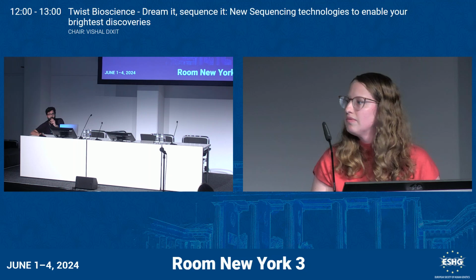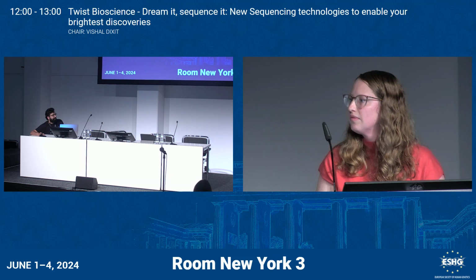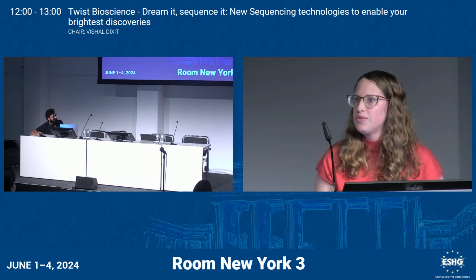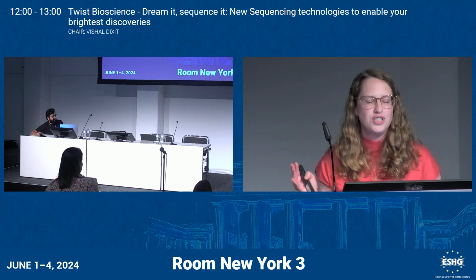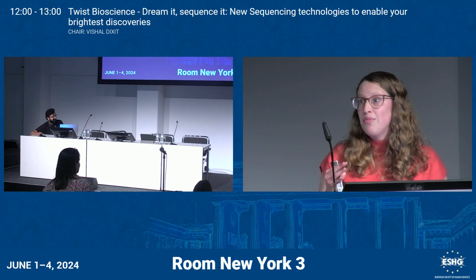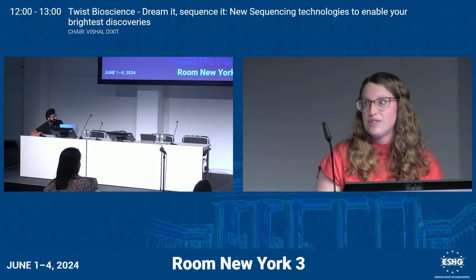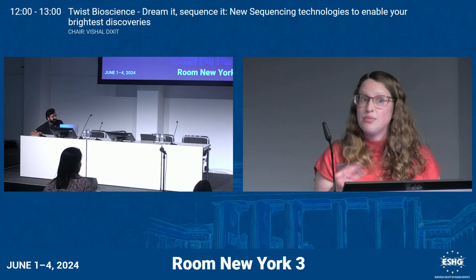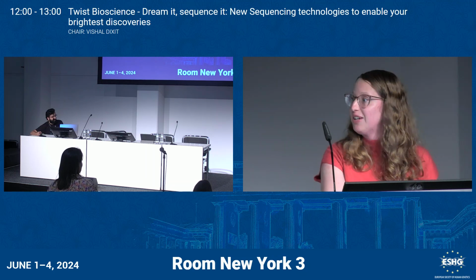If no one else has a question, I have one question, Suzanne. Do you need some improvement from the wet lab side, or is it really ideal right now? Yeah, where we've struggled a bit in the lab is with shearing. So that was quite laborious. We could use either the G-tubes where you can spin 24 at a time, or Megaruptor where we could just do 8 samples at a time. But recently the field has brought a lot of new, more automation-friendly shearing workflows out there. So this is something that we're investigating, and then hopefully we can bring the plexity up, because at the moment we could run 24 samples on Sequel II and 72 on Revio, and that requires quite a lot of sample prep in the lab.